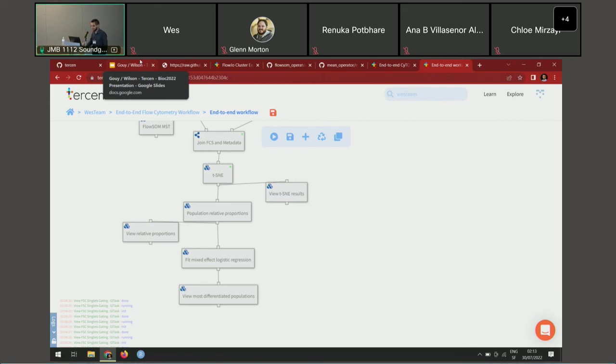So how do the immunologists go here and gate by themselves? From a bioinformatics perspective, it is very easy to follow, and this pipeline is very, very cool. But to make biologists or immunologists follow this path, like gating.